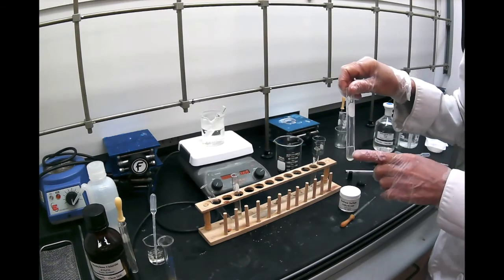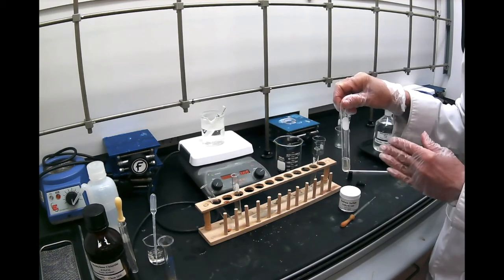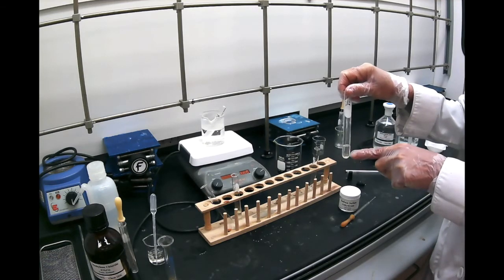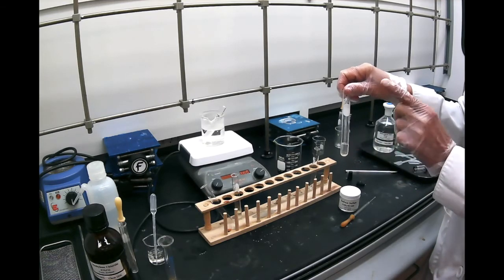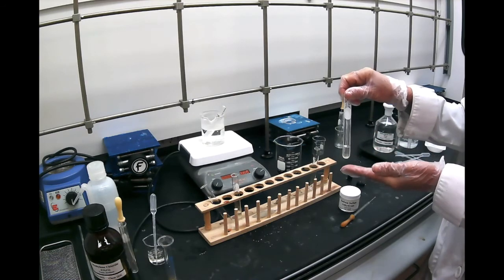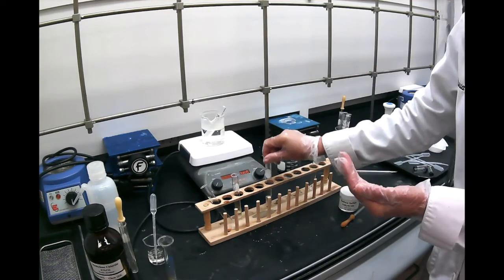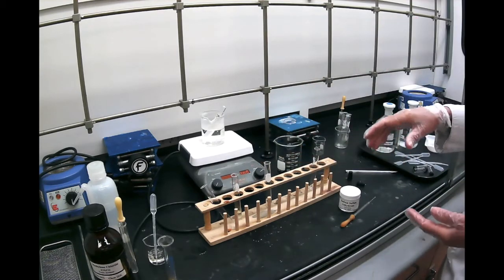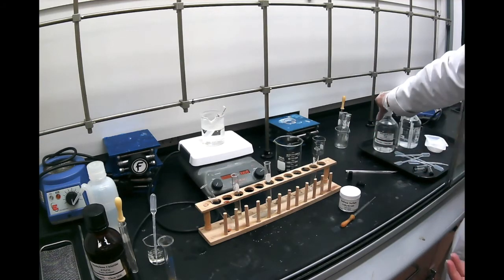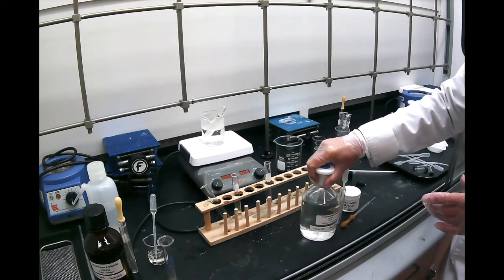Normally, since it's an active extraction, most of the benzoic acid should be in this layer. But at this point, it reacted with the base, so it's not anymore benzoic acid, it's a benzoate. So here we have sodium benzoate and water. But to recuperate it again, to see that we have benzoic acid there, is if we add some hydrochloric acid, the benzoic acid will be a solid.